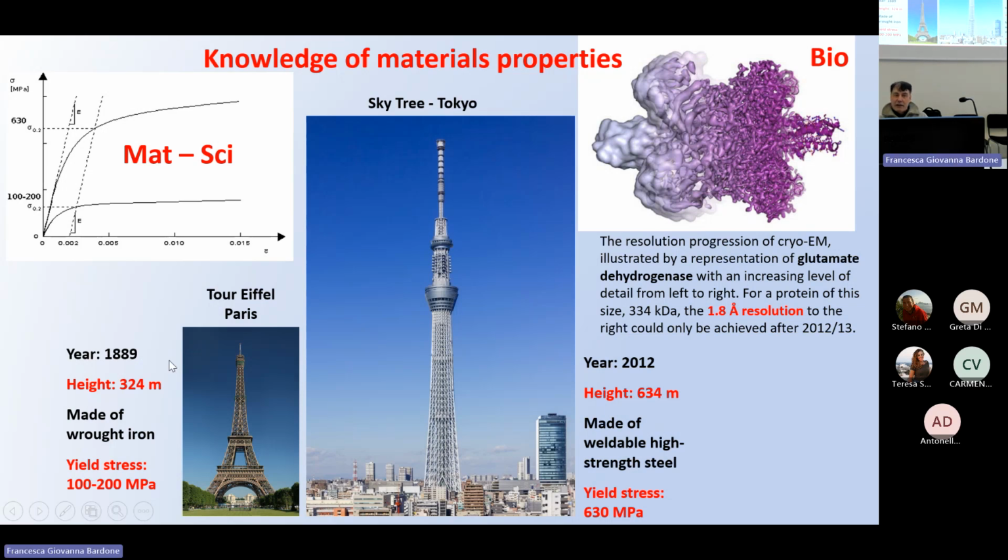So understanding how the crystal is made is fundamental in different disciplines, from the engineering point of view and from the biological point of view. This is a rush to high spatial resolution. We are looking for instrumentation technology to see where the atoms are and how the atoms are.